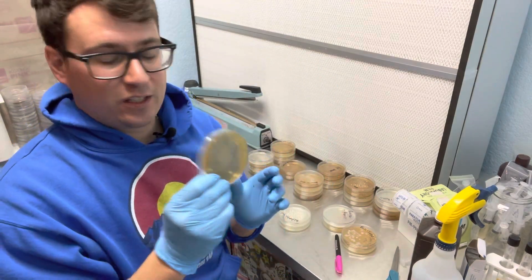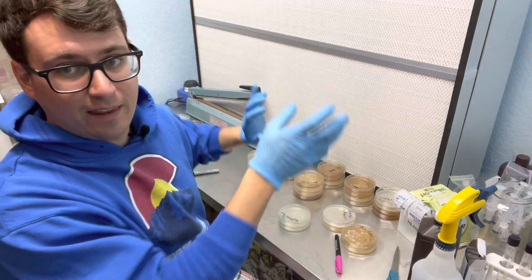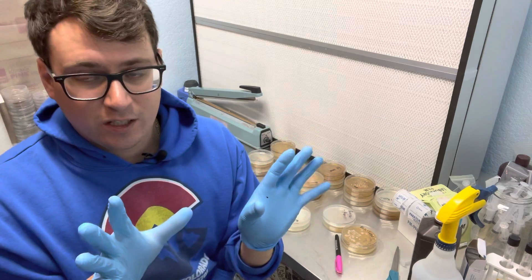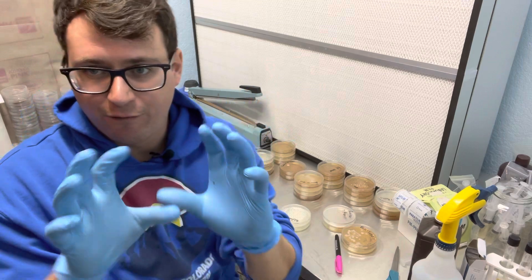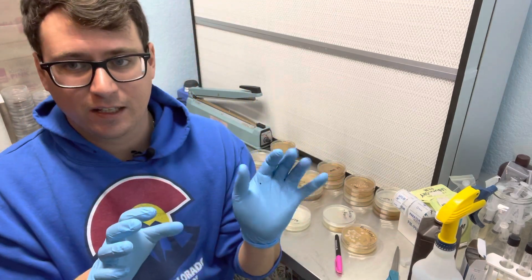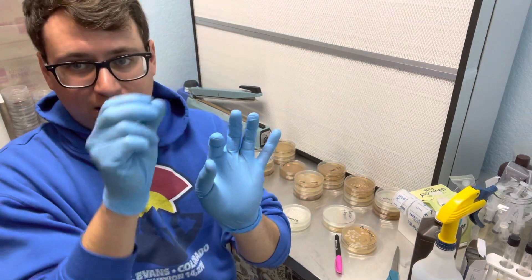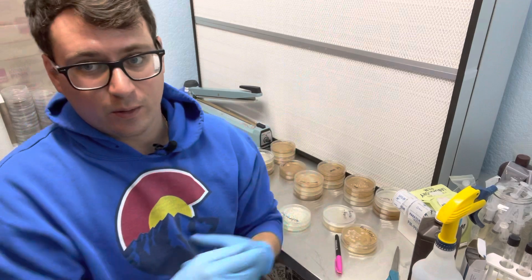Very exciting — I'm super pumped for these strains. They seem to be growing really fast. So I'm just going to let those colonies kind of find their way on the petri dish until about three or four days from now, and then once they start to form areas of segregation or overlapping areas, I'll start to segment those onto their own petri dishes and then run those through the trial.